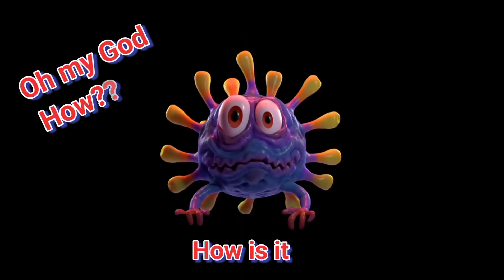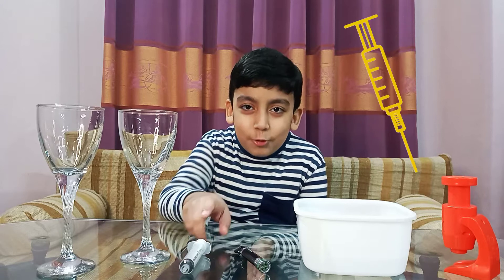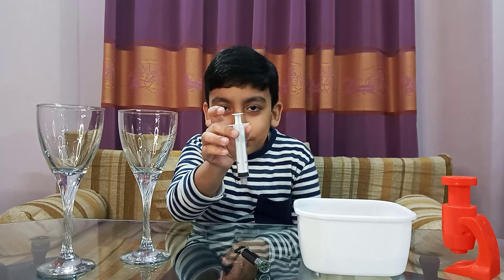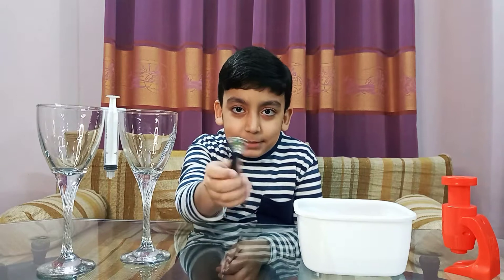Without any further delay, let's start this experiment by seeing germs with our naked eyes, without using a microscope. I'll show you how you can see a germ without a microscope. For this experiment, you need a syringe which has no needle, just like this, balanced between two glasses of water, and a laser beam like this one.